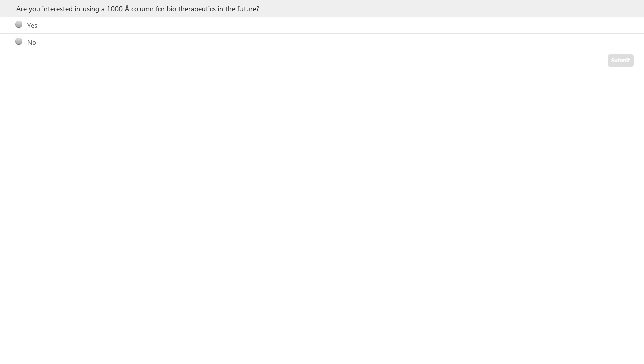Great. Thanks, Ben, for your very interesting presentation. And you're right, we'll now move to the Q&A. We had some questions that came in during your talk. The first one is, where is the protein going that is not recovered in the recovery comparisons versus temperature? What happens to recovery with repeat injections at each temperature?